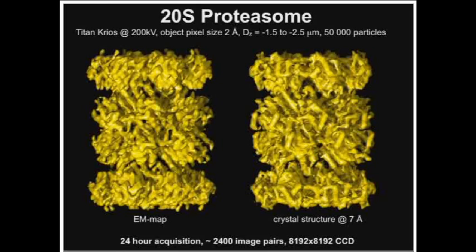But a comparison between two microscopes like this is difficult, because it's a different sample, because cryo samples are different. It's not a real comparison. I don't think that it's really feasible or really wanted. But it should be done by the companies, not by scientists. But I guess JEOL is not very interested in comparing the microscopes, and FEI is not very interested in comparing the microscopes.